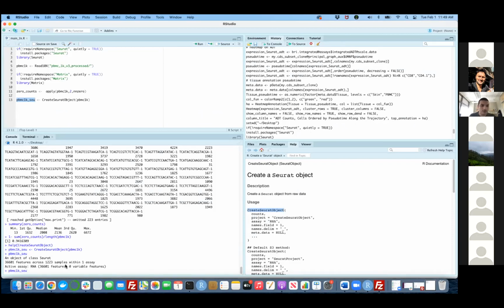Say you want to check if the count matrix is there. You can use @, choose assays, then $ and it gives you RNA. Seurat is able to analyze multiple assays, like ATAC-seq and other modalities available along with RNA, and you can store them in the same object too.